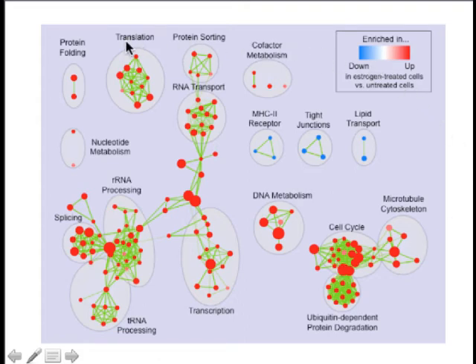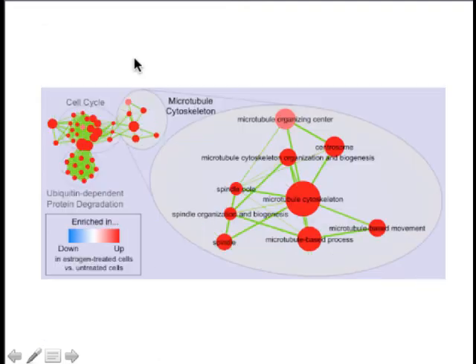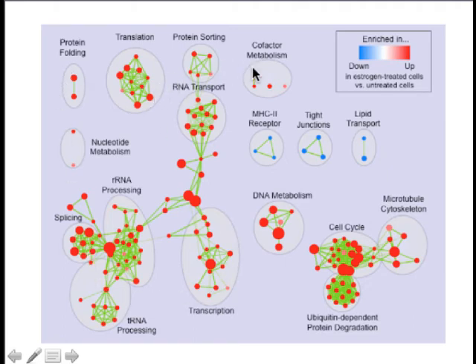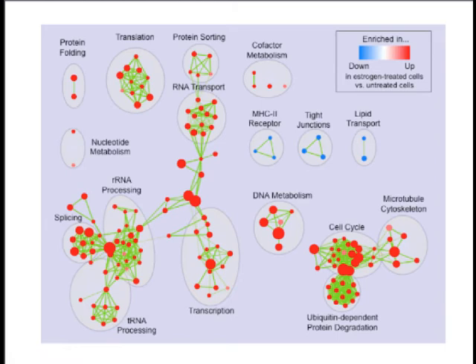This is what the enrichment map looks like — it provides a very nice visual overview of the pathways. Each circle is a pathway, and you can see a bunch of pathways that are related to each other. You can zoom in to see the actual pathway names, like 'microtubule organizing center' and 'centrosome' — these are gene ontology terms, mostly biological process terms. You can quickly see there are bunches of pathways going up and down. I usually call a group of pathways a 'theme' — like a translation theme or a microtubule cytoskeleton theme. This visualization helps you more quickly process the results of enrichment analysis.